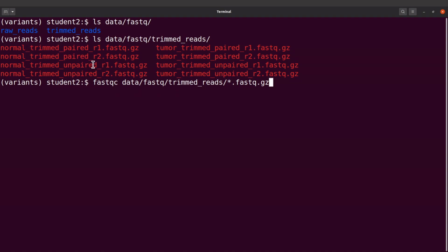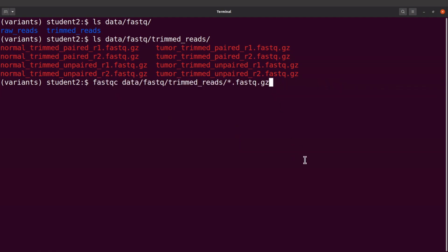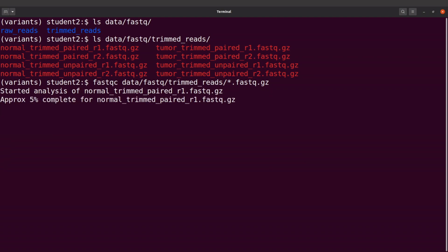I always try to use a naming convention so that I have a brief description of what these files are. It's to describe the file so that I will know what treatment I have given the files or what processing I have done. Because I have trimmed, that means that these are trimmed. That's what you need to know. So I'm going to run fastqc and then use multiqc to aggregate the results.